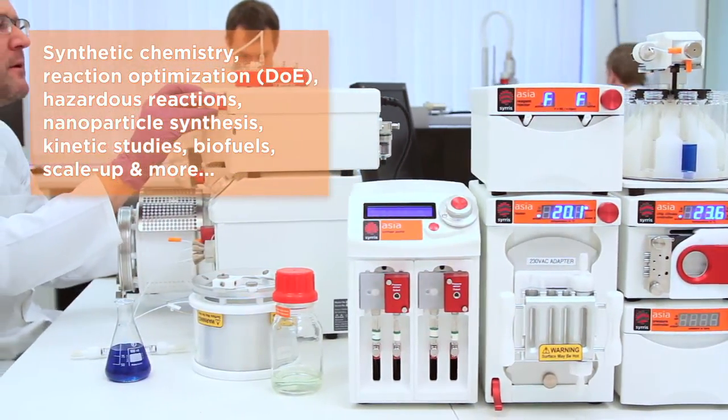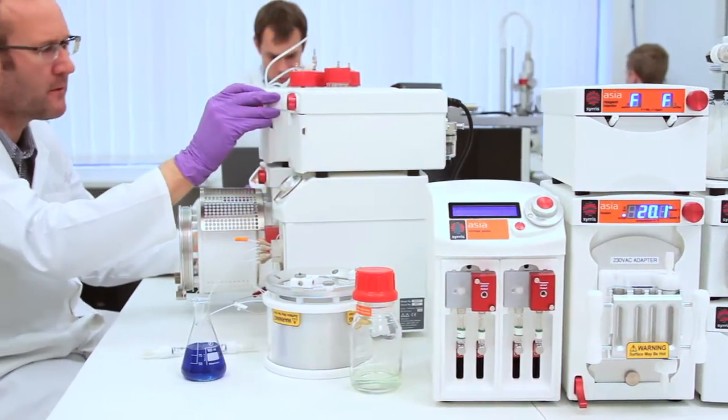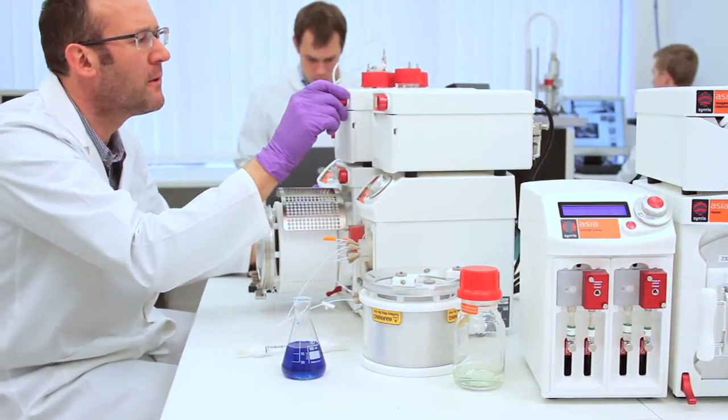Also because of the scale range from milligrams to kilograms, it is used in both discovery chemistry and process chemistry.